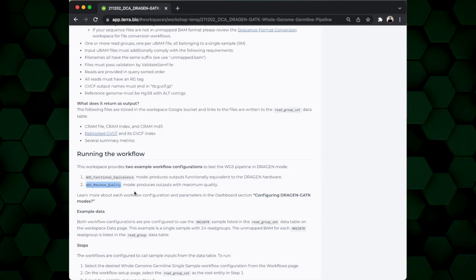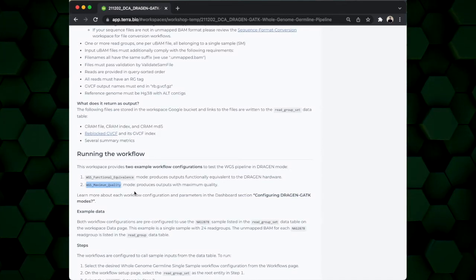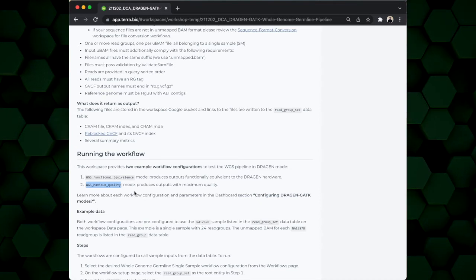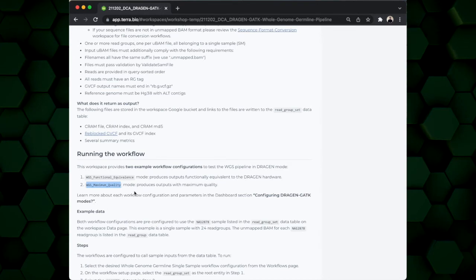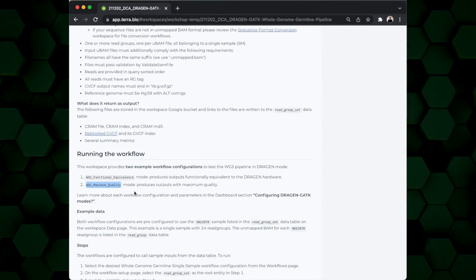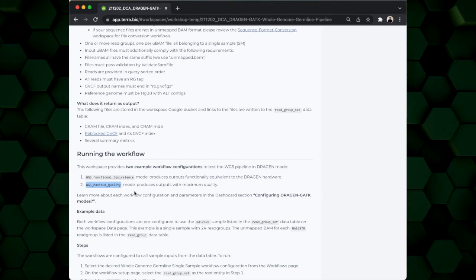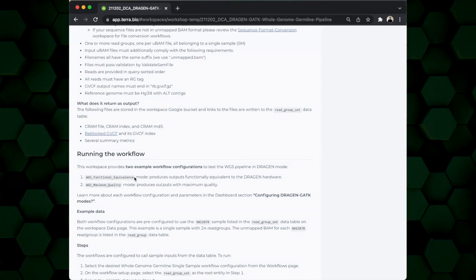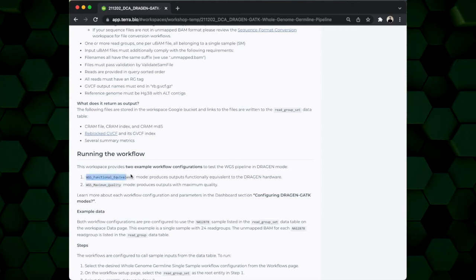And it's doing this because it's running a few additional steps, like unmapping contaminant reads and then using spanning event genotyping, which can have some effects on functional equivalence. But if what you're after is the maximum quality for your outputs that is possible, then this is what you can use. What I'll be doing today is running through this functional equivalence pipeline though.